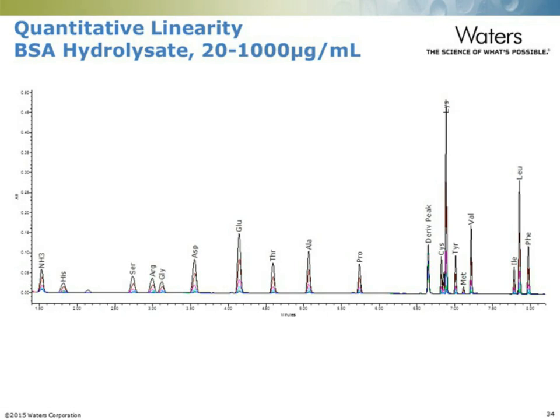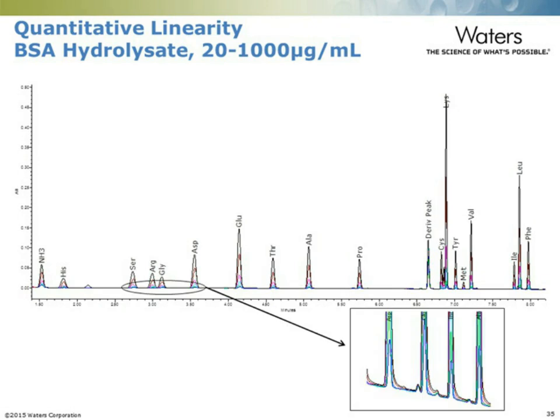If we zoom in to the baseline, you can see that the smallest peaks are still perfectly symmetrical, easily integrated, and have very good signal to noise. You also start to see some of the small unidentified peaks that are often observed in the analysis of real samples and represent either side products of the hydrolysis or background from the environment.